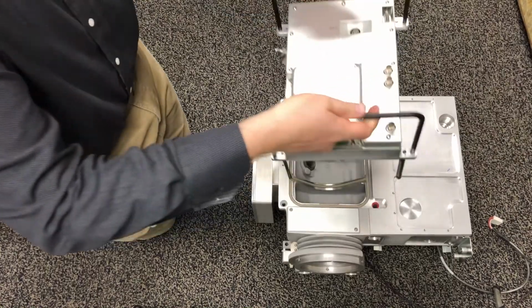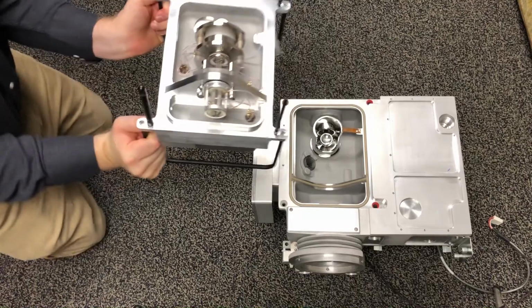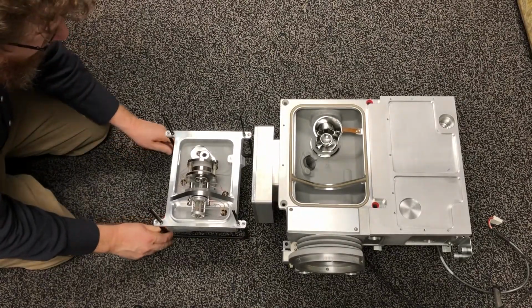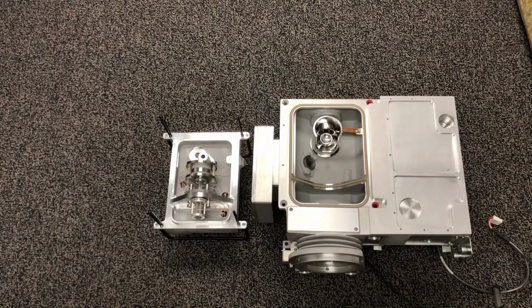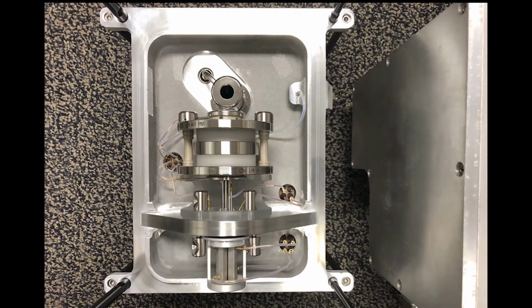Now, that front end has already been pulled out, so you see that hole at the front of it. All right, so I pulled out the guts of the mass spectrometer after the ion transfer capillary there and the skimmer and those first few lenses. So what I've laid down on the floor is the heart of the mass spectrometer that has the last ion optics and the detector and the mass analyzer.